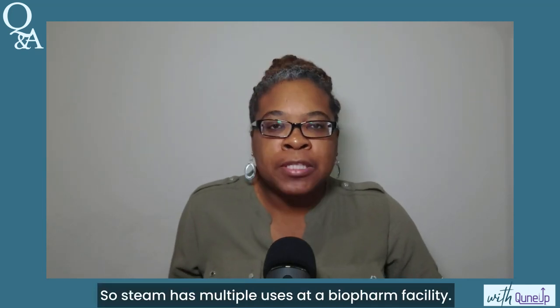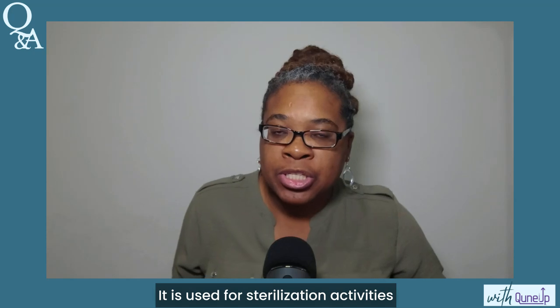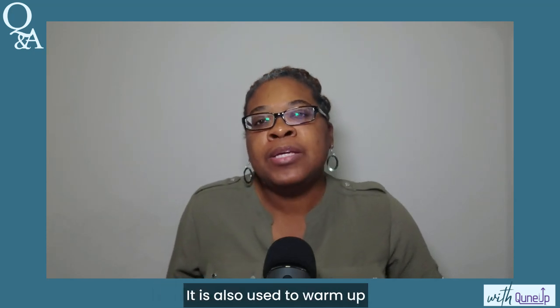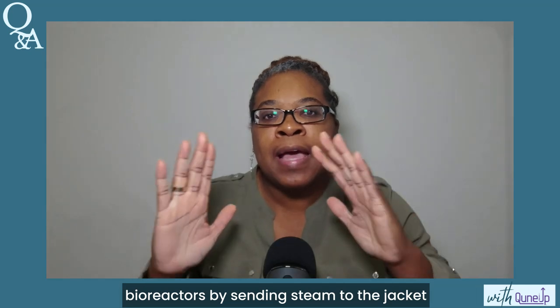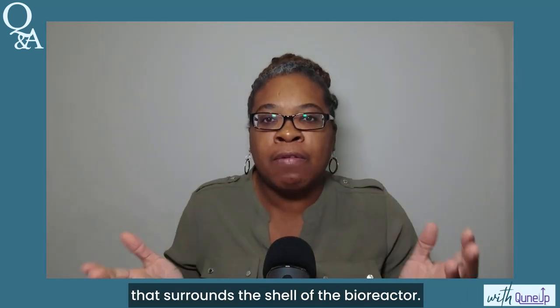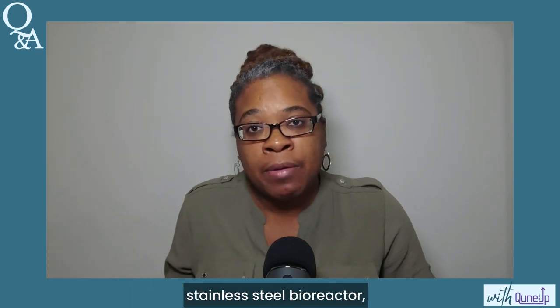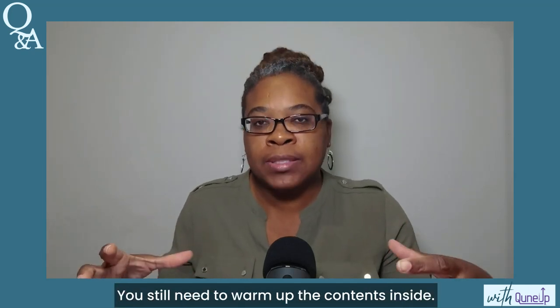Steam has multiple uses at a biopharm facility. It is used for sterilization activities such as SIP, steaming in place. It is also used to warm up bioreactors by sending steam to the jacket that surrounds the shell of the bioreactor. Now, this is true whether it's a traditional stainless steel bioreactor or a single use bioreactor. You still need to warm up the contents inside.